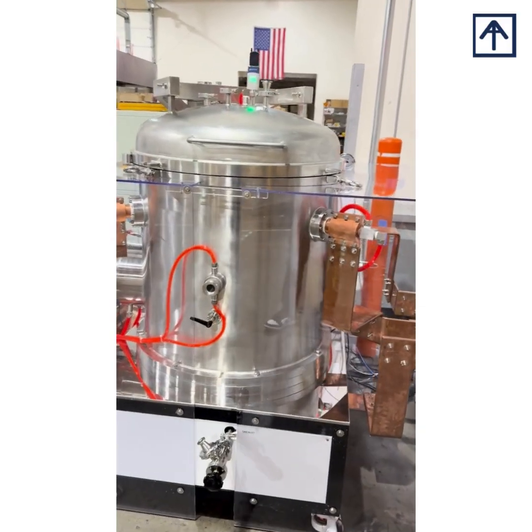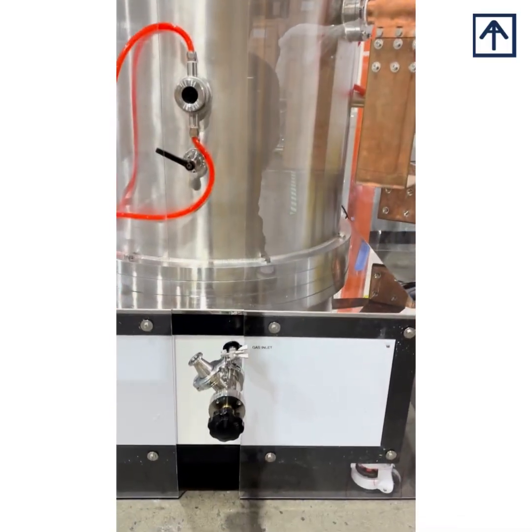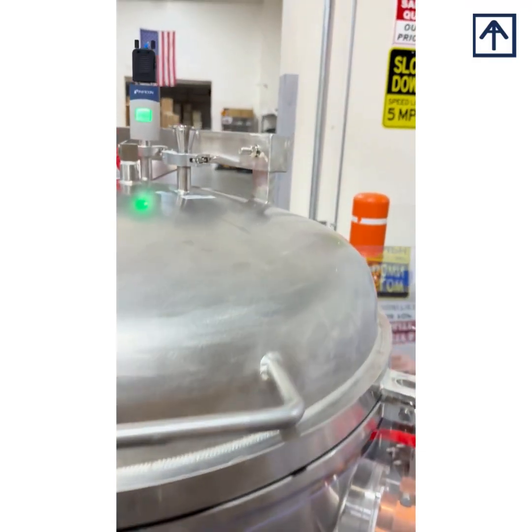So for the ports on the top, you can have the inert gas environment created either on the top end of the unit, or on the bottom like on this port, or on the top using that port on the top.